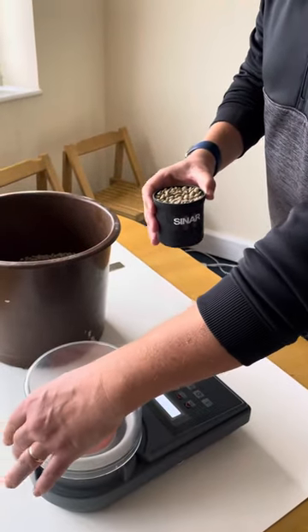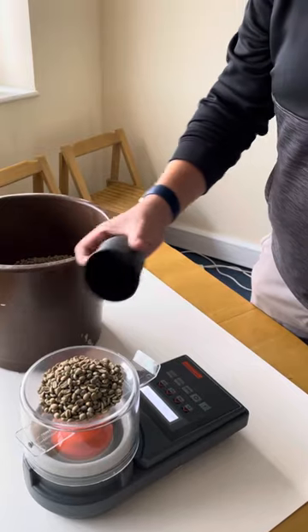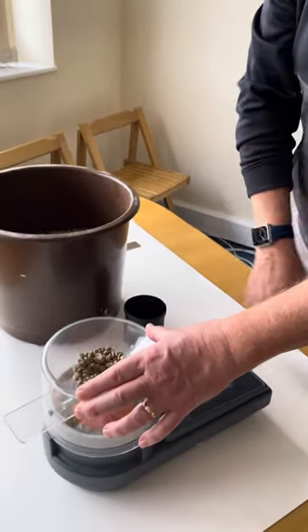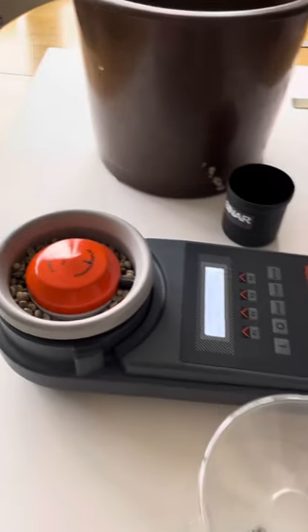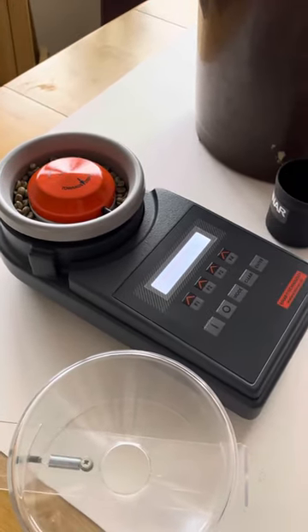You then use the loading hopper to make sure you don't lose any of your beans. Hold that into the loading hopper — that will then load the unit for you. Make sure everything's nice and clean, and then simply press test on the instrument.